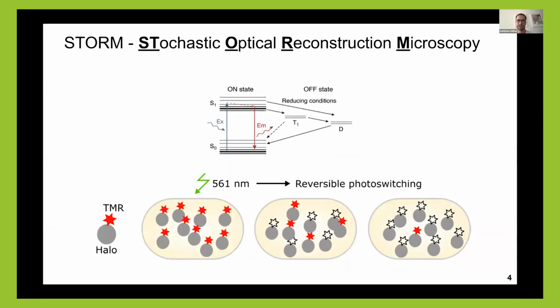If we play such a game, for example, if we can switch these fluorophores, now I'm showing you a bacteria cell with multiple proteins labeled with a fluorophore. We can excite them and then detect fluorescence. If they are all shining together at the same time, that's not really beneficial.